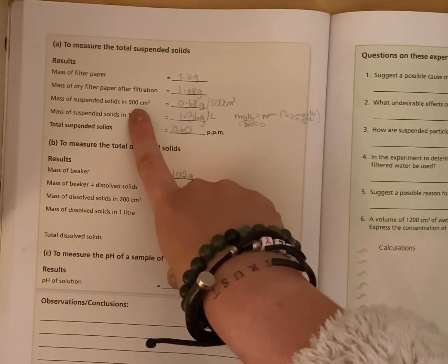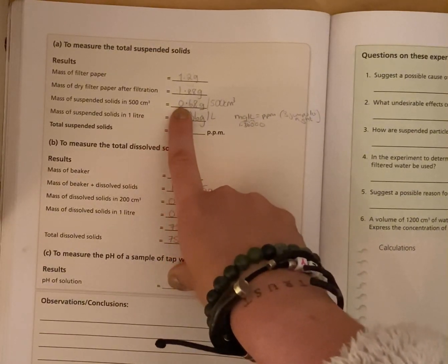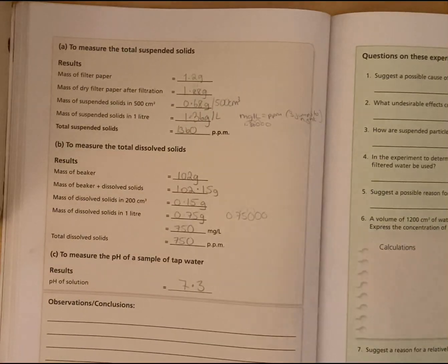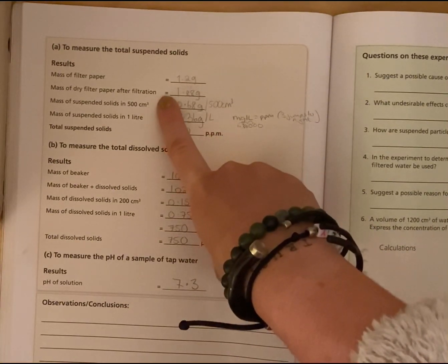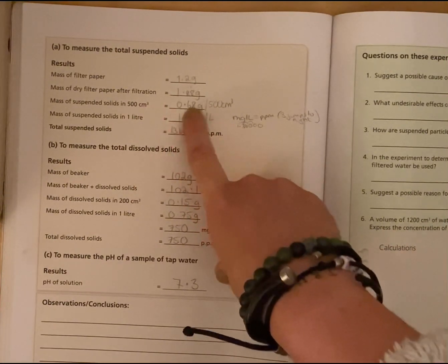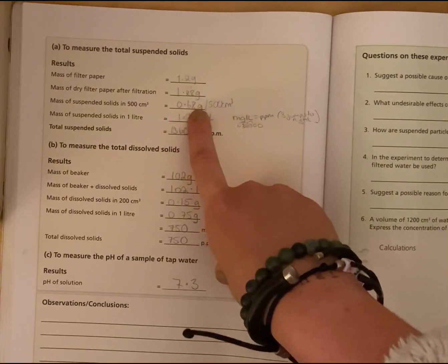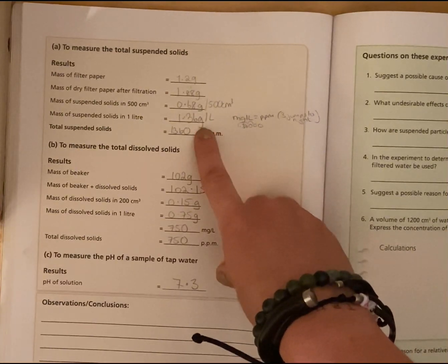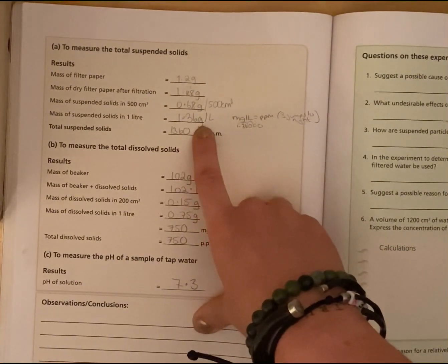So if we used 500 centimeters cubed, that would be 0.68 grams per 500 centimeters. And all I've done there is take this number away from this number. So the mass of the filter paper after the experiment minus before, and because I poured through 500 centimeters cubed, I can say that there's 0.68 grams in 500 centimeters cubed. To bring that up to 1 litre, you just double this number, and I've got 1.36 grams per litre.